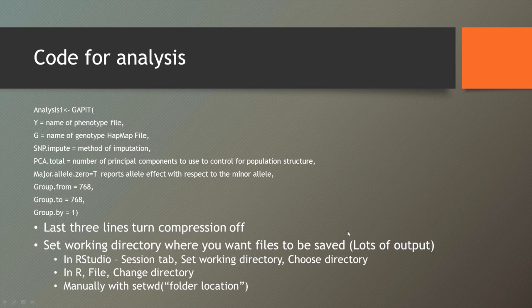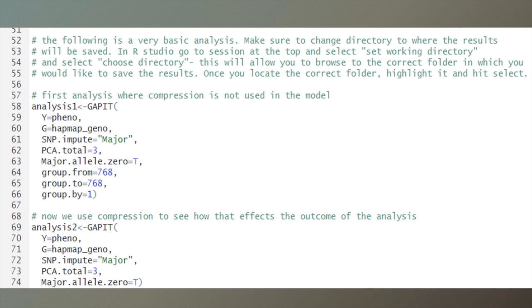There is a lot of output that is generated. And so there's a few ways you can do it in RStudio. Use the session tab. In R you can use file, change directory, and then manually with set working directory. And here's what that looks like in the actual RStudio environment. So you can see it's the same lines of code. And this is when you're not using compression.